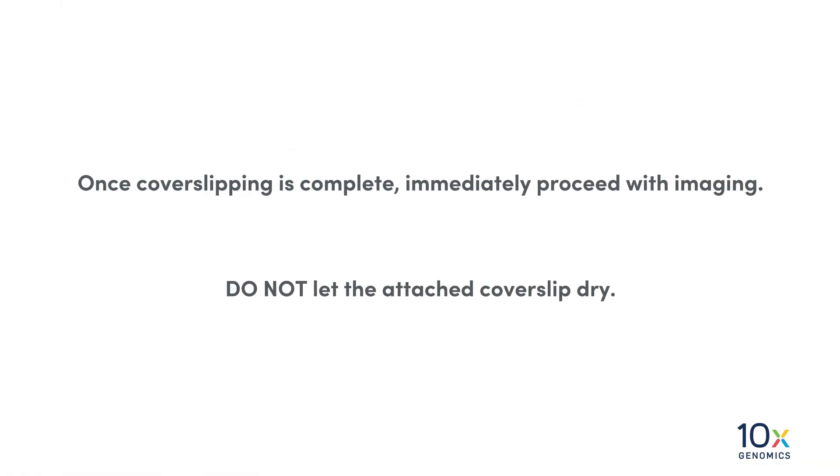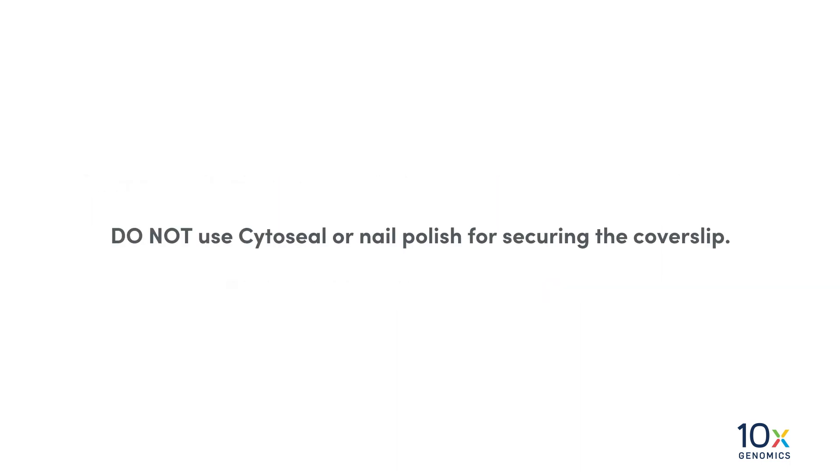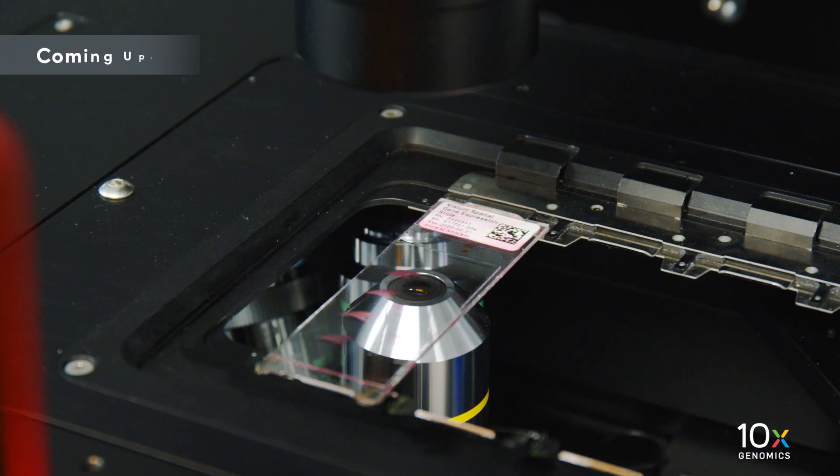Once cover slipping is complete, immediately proceed with imaging. Do not let the attached cover slip dry. Do not use Cytoseal or nail polish for securing the cover slip. We have placed a cover slip on the slide. Next, we will image the slide.